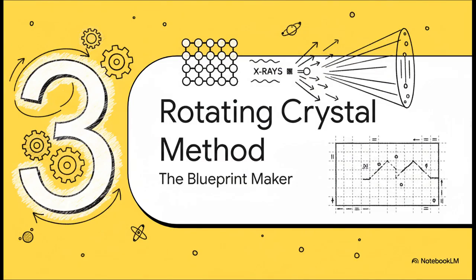But the Laue method has its limits. It's great for orientation, but not so great for figuring out the crystal's actual atomic structure. For that, we need a different approach. So let's bring in our next tool, the rotating crystal method. This is what gets us the blueprint.